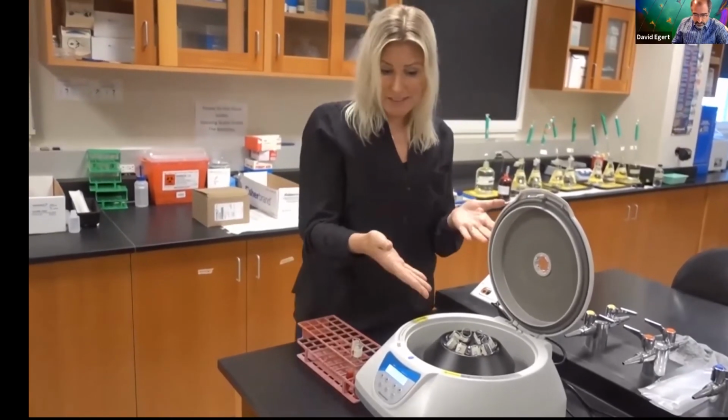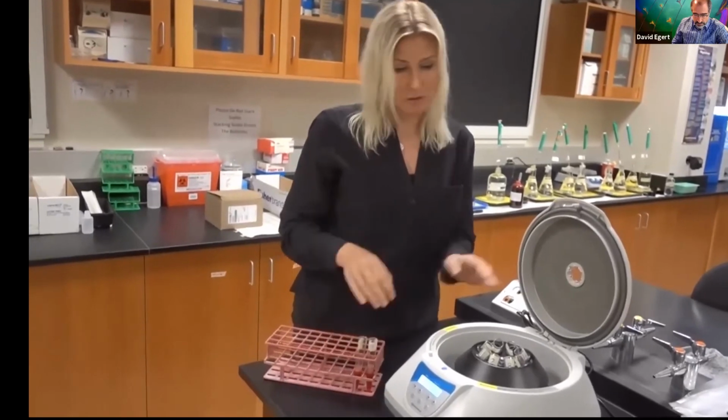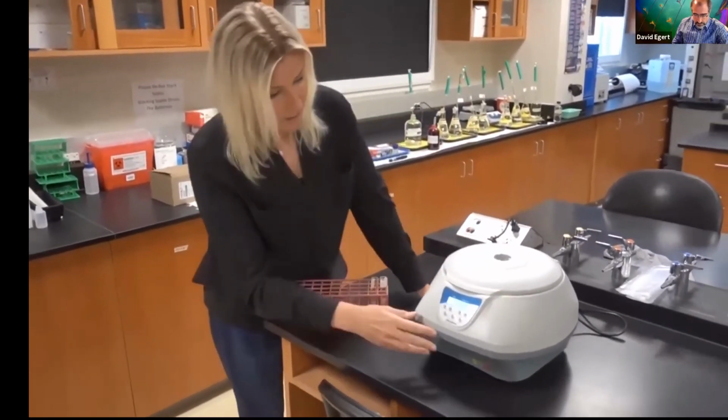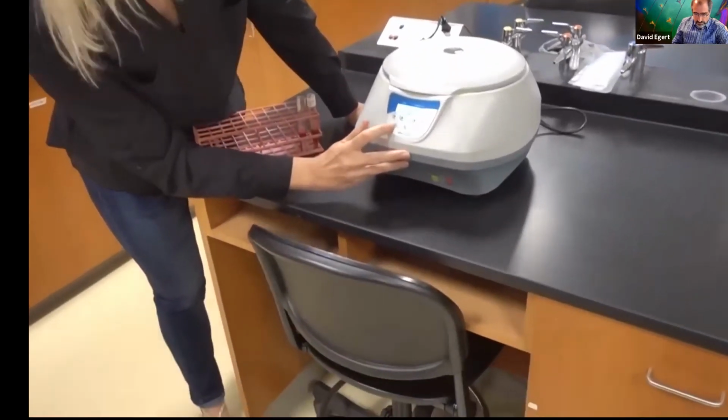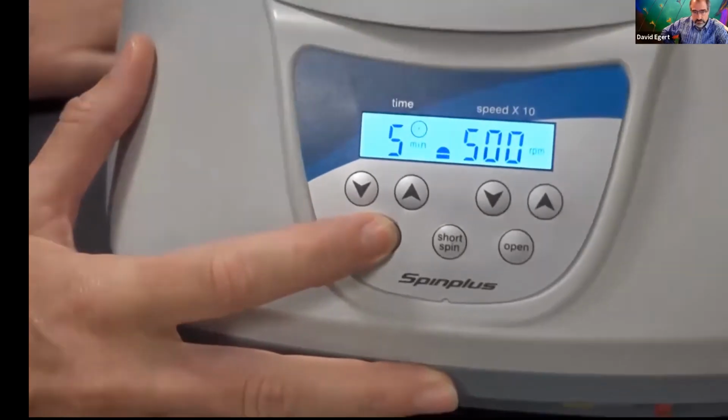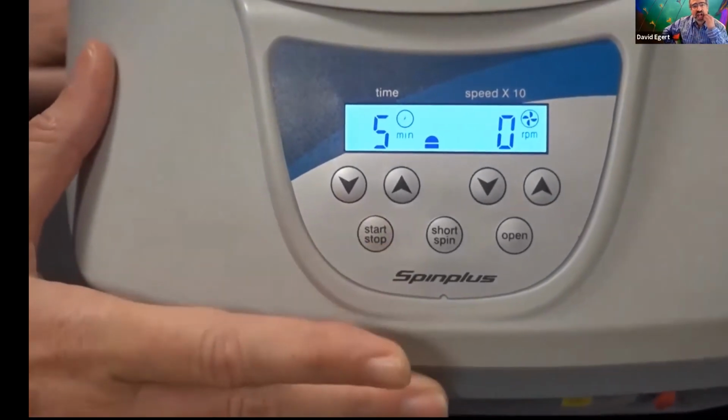All right, so we're now set. We're going to have to save 2 test tubes for later. You would close it, and then all you need to do is hit start. This thing should start up, and then it stops automatically after 5 minutes.